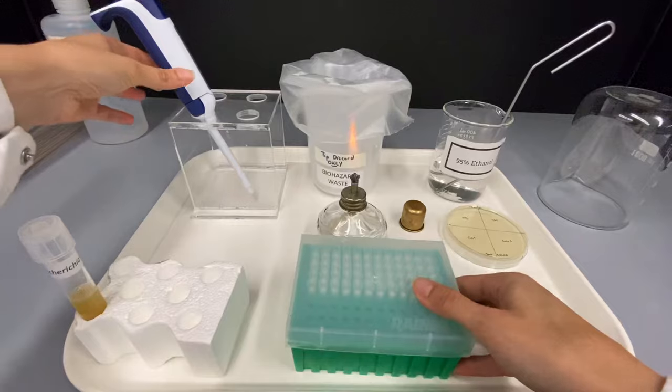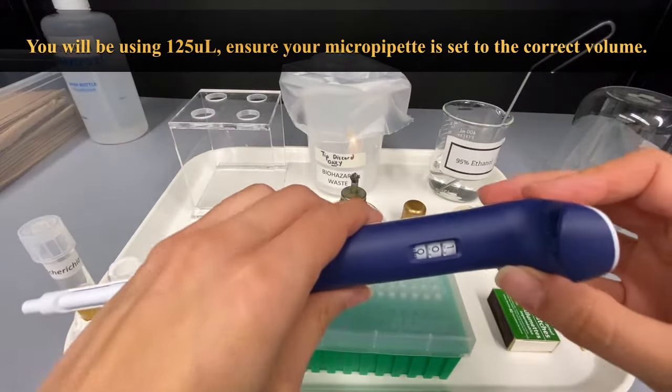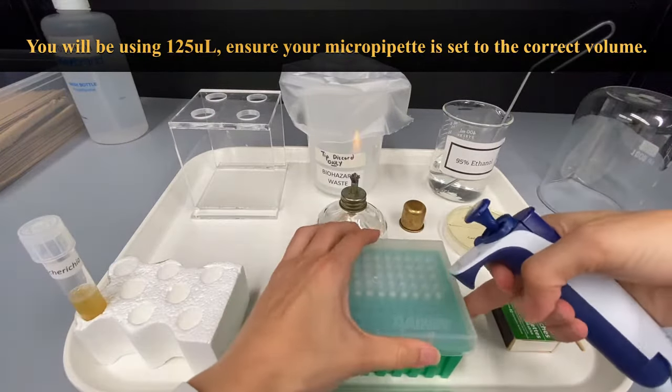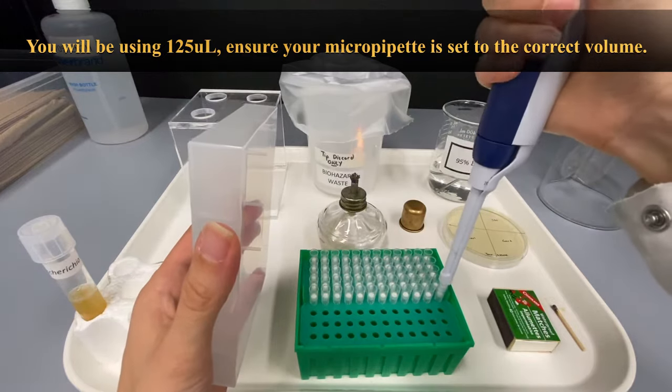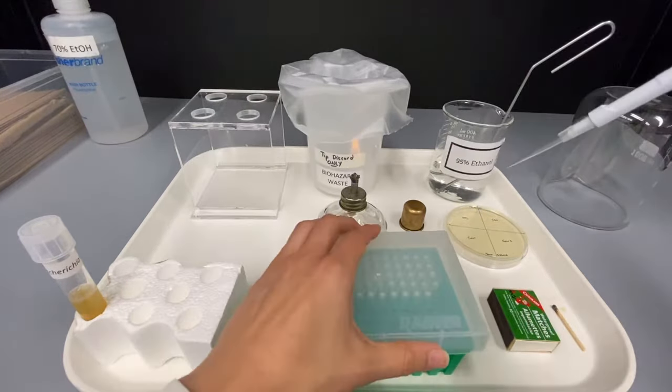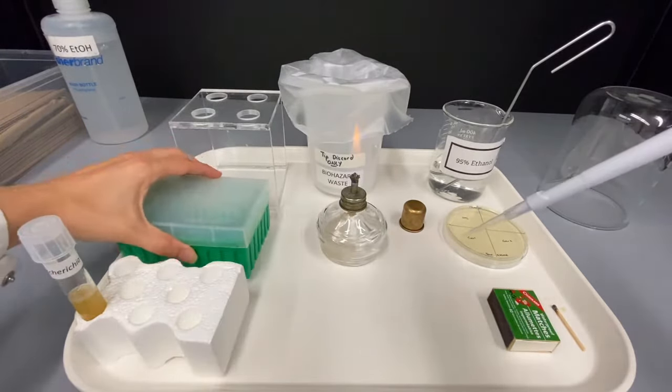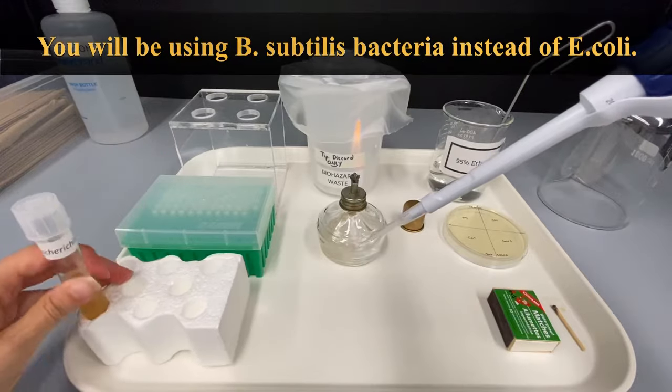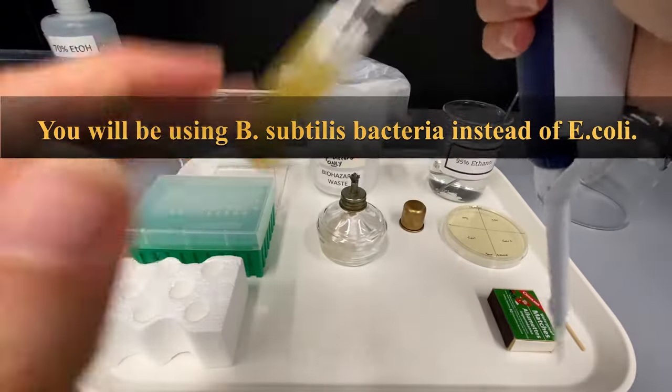Pick up your micro pipette and make sure that it is set to 100. Lift the lid on the tip box. Put the pipette in a tip and push firmly to ensure a proper seal. Resuspend your E. coli bacteria by gently flicking the tube.